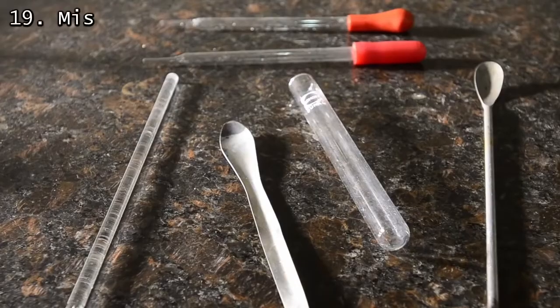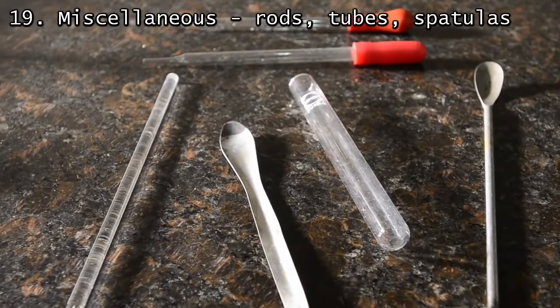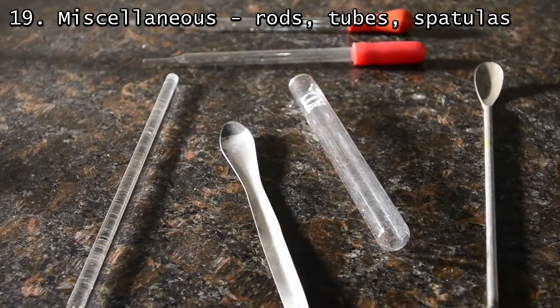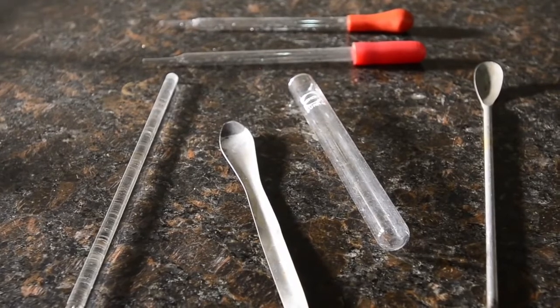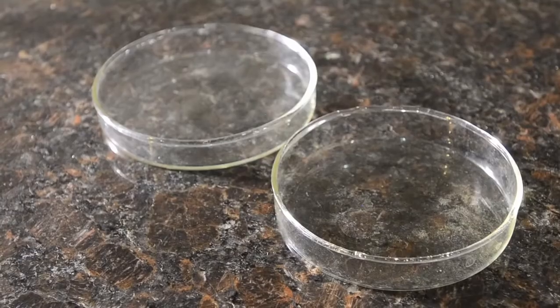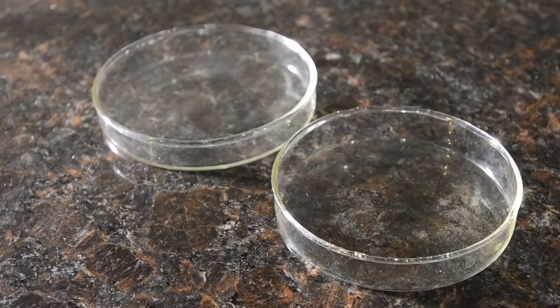Finally, some miscellaneous but useful stuff: glass rods, glass tubes, spatulas, test tubes. Ironically, we don't use test tubes very often, yet they remain the iconic symbol of chemistry. Pipettes for dropping liquids are useful. Petri dishes are also very useful for evaporating solutions and for weighing solids.